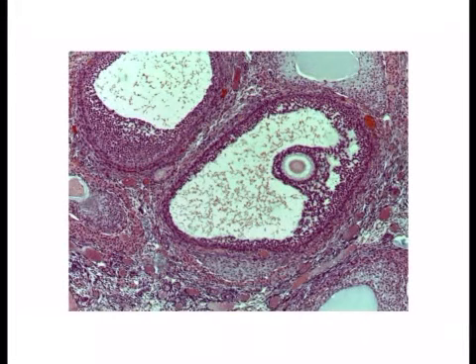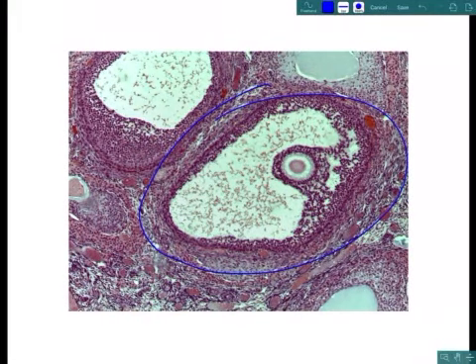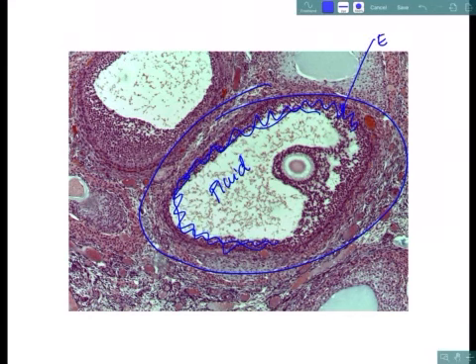We get a closer look at this Graafian follicle. This is actually a fluid cavity, and these are actually cells. During the first phase of the cycle, these cells produce estrogen. You're predominantly producing the hormone estrogen from around day 8 through your entire cycle, but in higher amounts from about day 8 to day 12. The higher amounts of estrogen that you pump out each day kind of tell your brain that this egg is ready to go.